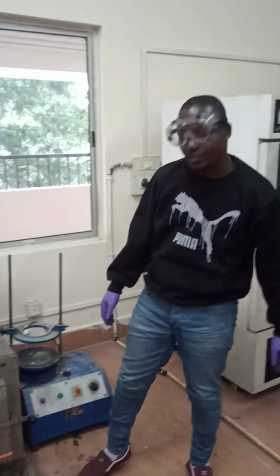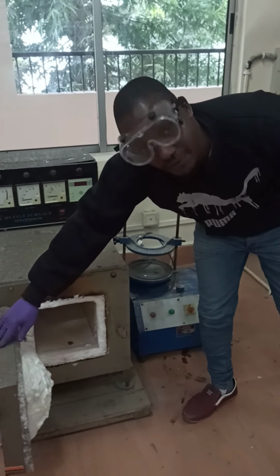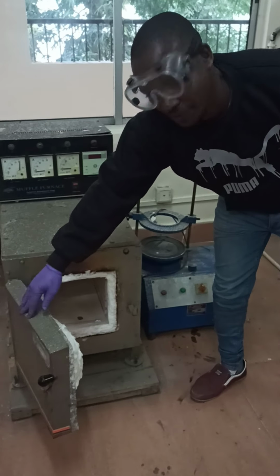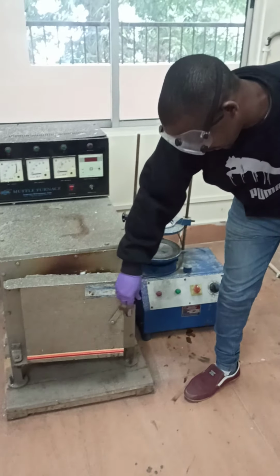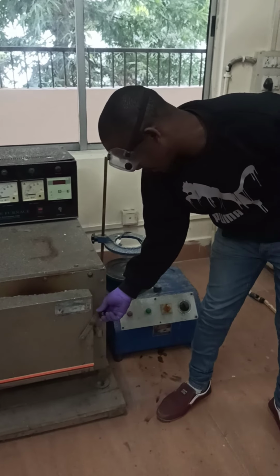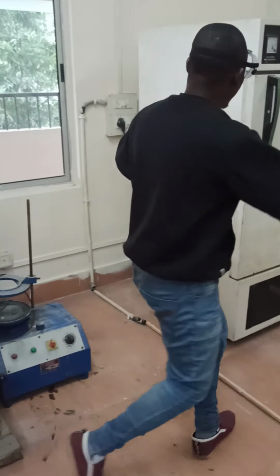We are having this. You see these instruments? It's called the furnace. You know the function of the furnace, for burning of some samples into ashes. At the end of the day, we end up calculating the percentage of a particular element.